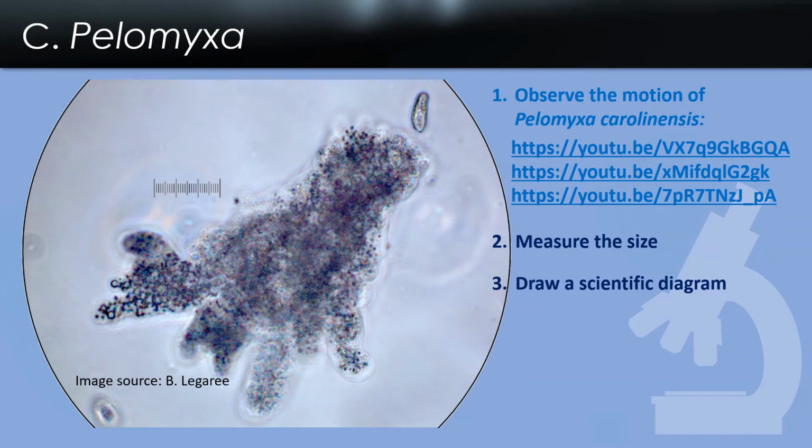It's really unfortunate you are not able to be with me in the lab and to take a look at these. These specimens are very fun to look at. This lab is pretty low stress and usually is a lot shorter and quicker than all the other ones. Mostly you're observing behavior, answering some questions, measuring size, and drawing some diagrams. So check out the amoebas. Like I said, there are lots of really cool videos on the internet if you're really interested in these things. They're all showing different eukaryotic organelles and cell features, although, like I said, today we're focusing on motility structures.